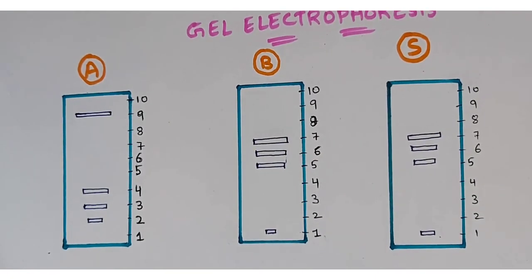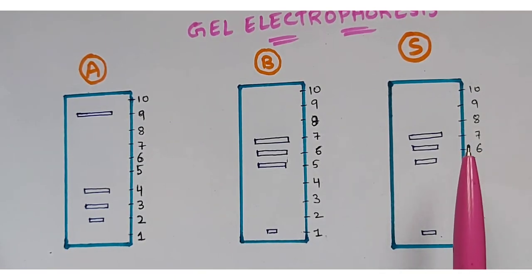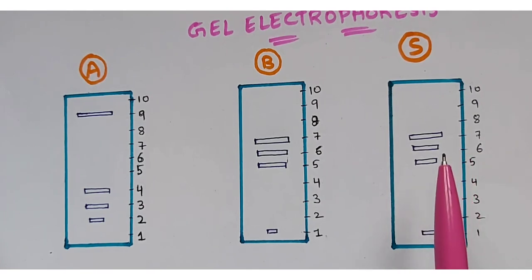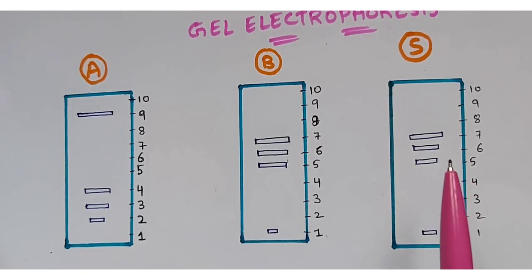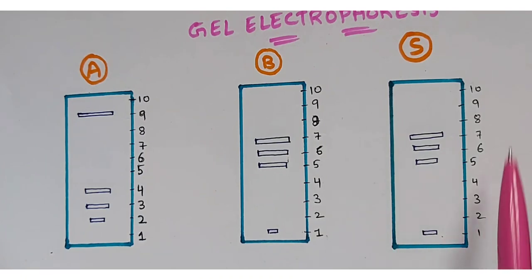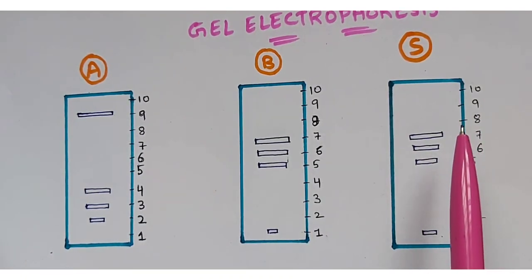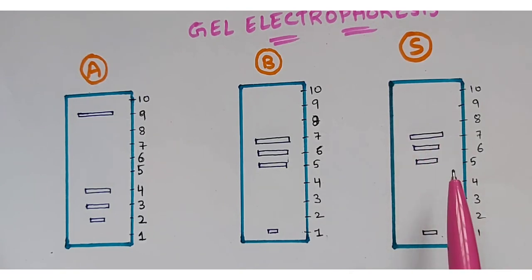Now what you're going to do, this is the sample of knife. See, we have taken our DNA sample from the knife, right? And it undergoes the process of polymerase chain reaction, and now we have the DNA sample of the knife, and now you are going to do the procedure again here. So now we are going to take another agarose gel plate, and again you are going to isolate it. Then again it will get separated.